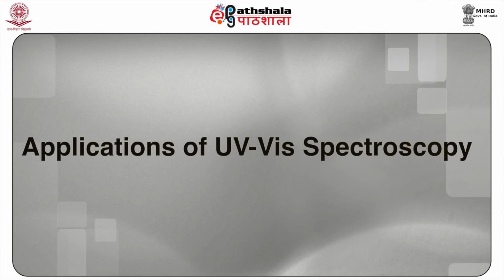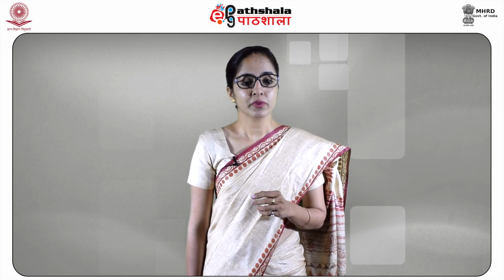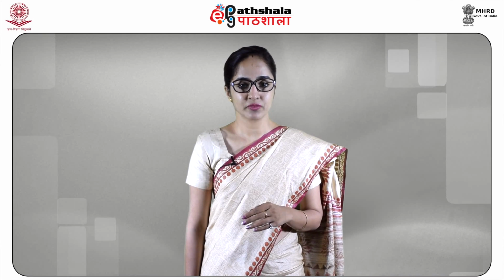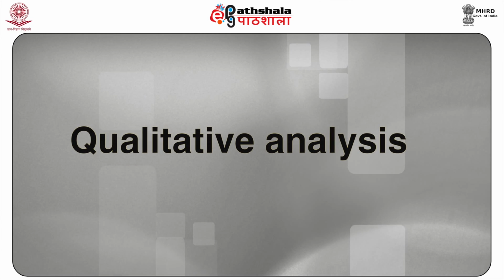Now, next are the applications of UV visible spectroscopy. Students, UV visible spectroscopy is used extensively in teaching, research and analytical laboratories for the quantitative analysis of all molecules that absorb ultraviolet and visible electromagnetic radiations. The first application will be qualitative analysis.